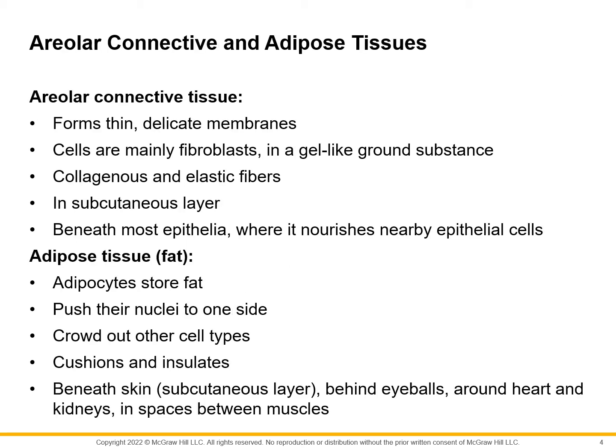All right, so the first one we're going to look at is areolar. I'm hoping that when you hear this, you automatically think hair fibers, because this is the one on our lab slides. It has these dark lines in it that we will see are collagen and elastic fibers that make up the most unique aspect of the tissue slide. It looks like someone had just gotten their hair cut and were making the tissue slide, and their cut hair fell on it and got caught under the cover slip.